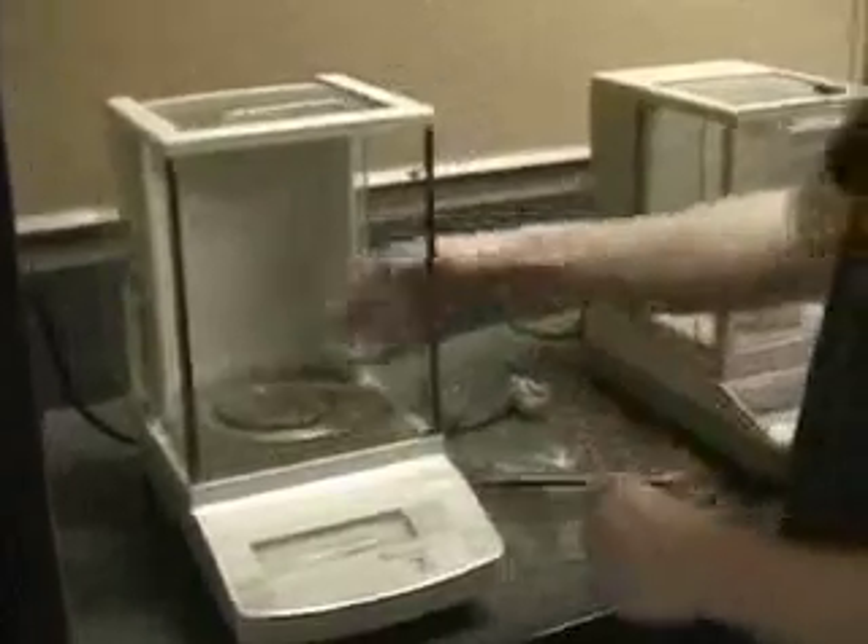The first thing you must do is find the mass of your sample. We use an analytical balance to get higher accuracy and precision.